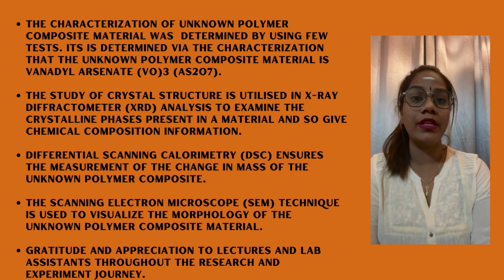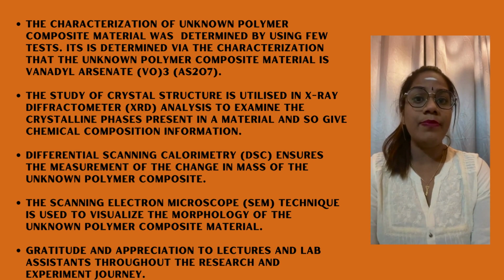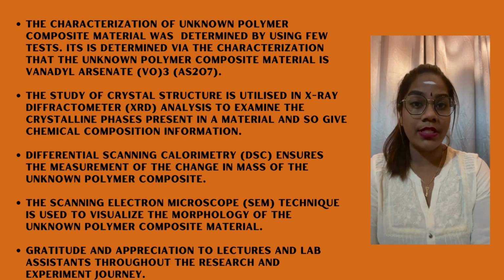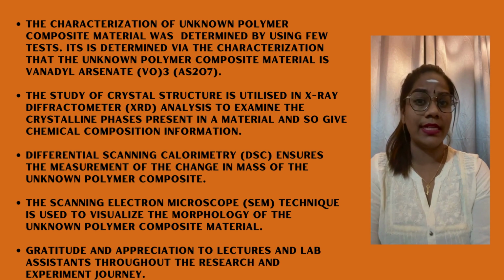The SEM technique is used to visualize the morphology of the unknown polymer composite material. SEM uses a computer system in conjunction with the electronic console; a bulky console with control knobs, CRTs, and image capture device is no longer necessary.